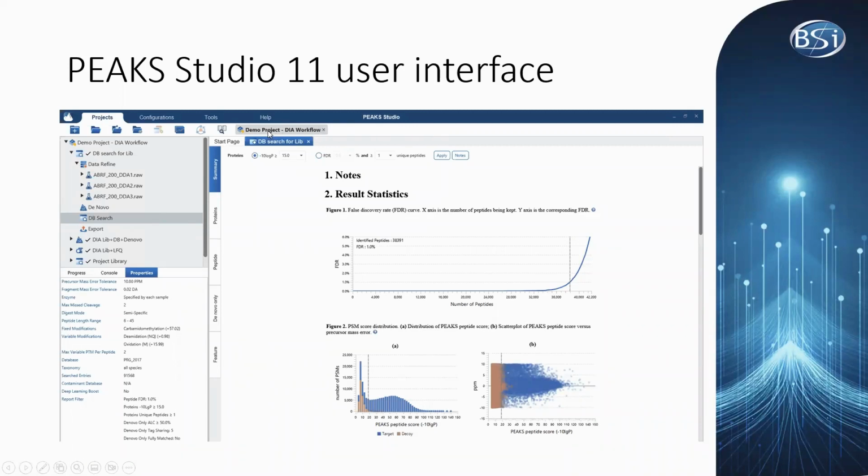And then within each project, you can run multiple different types of analyses. And then based on what you've opened up from this window, the different analyses will appear as tabs underneath each of these projects. And I'll go over a few other new features and icons shown in the top a little later in the talk. And the summary page and the other tabs look very similar to previous Peaks Studio versions, with just a couple differences.